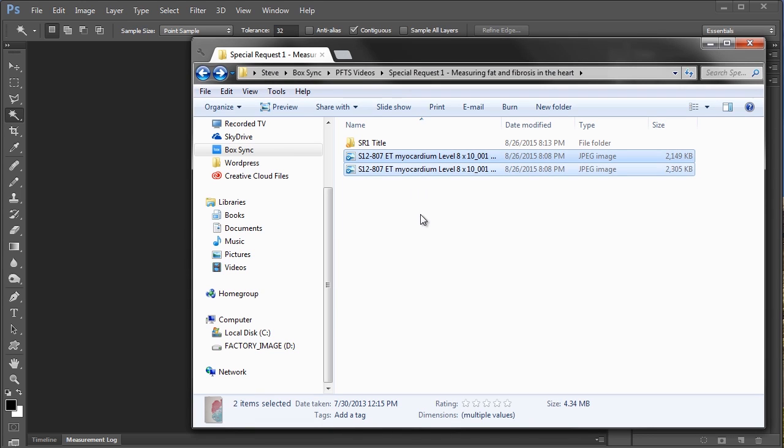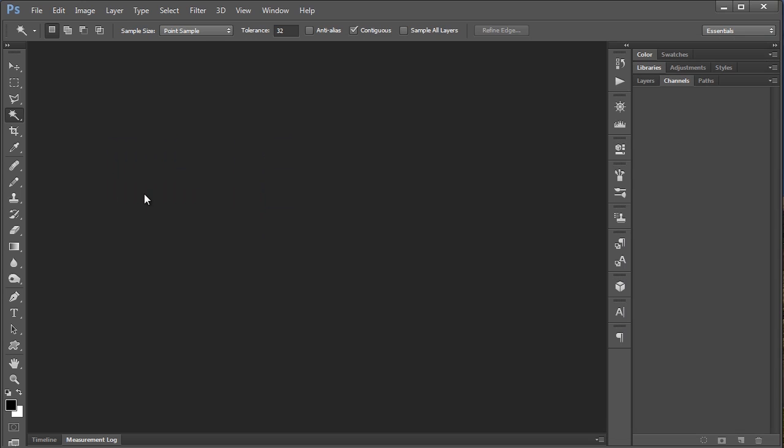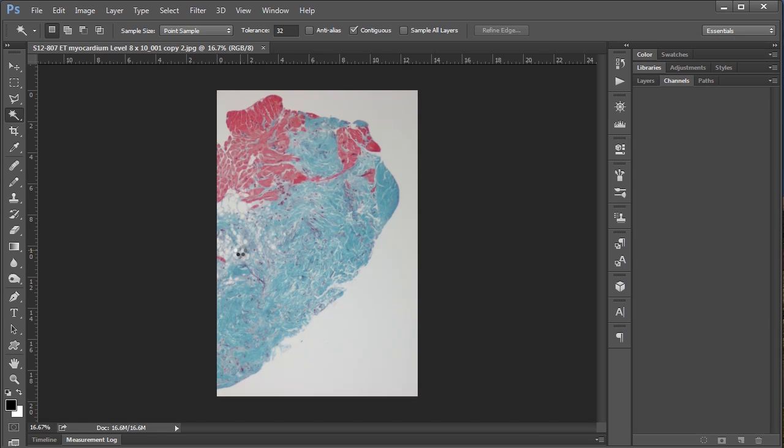Sometimes when you're taking light microscopy images of a histological section, you may find that the section is too big for a single field of view. So you have to take a couple of images which you're going to want to combine into a composite later on. Which is exactly what I have here and in this case just two images. So I'm just going to take these two images and drag them into Photoshop.